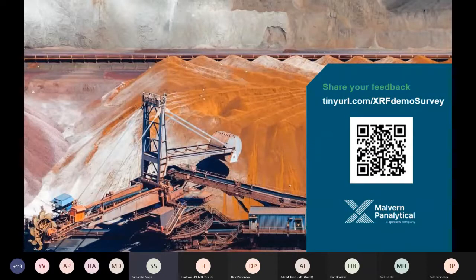Okay, great. Does helium always be required for analysis at all times? No, the helium is only used in the condition sets that require it. And so if you're only running one light condition set to look at magnesium and aluminium, in this program that I've set up, that runs for 90 seconds. And so the helium is only operating while that one condition set is running. And then when it switches, it turns the helium off and the system flushes back with air, which helps to reduce the amount used. And as I said, you can get up to 5,000 analyses off one bottle.